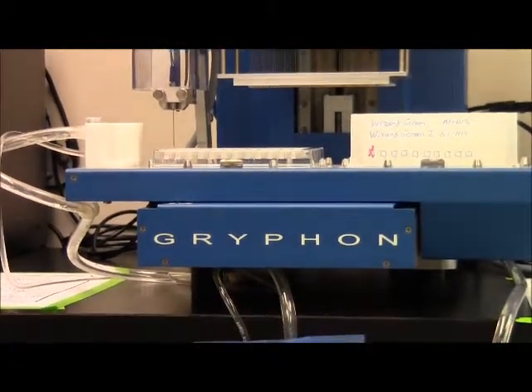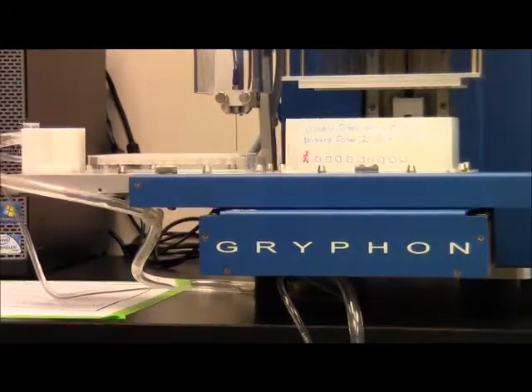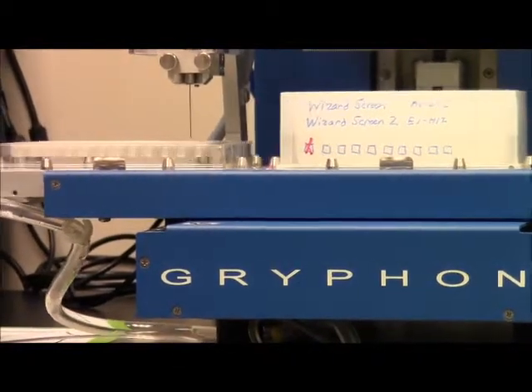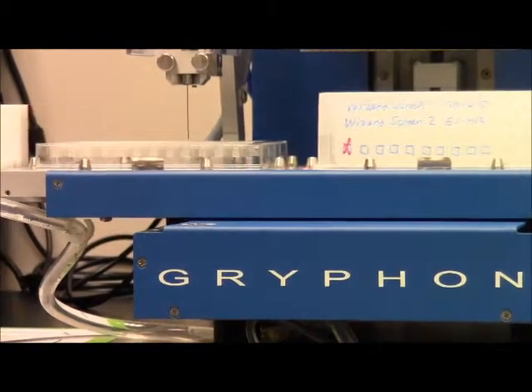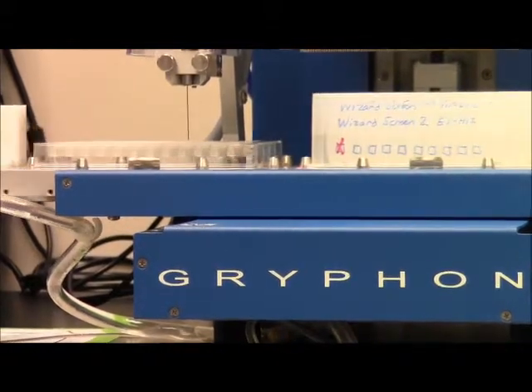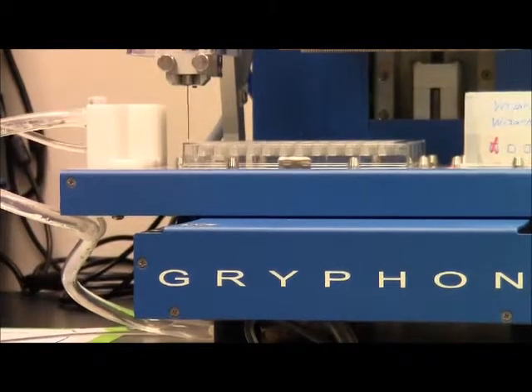Well number 1, 3-well: 1st row, 2nd row, 3rd row, 4th row, 5th row, 6th row, 7th row, 8th row — got crystals. Very good, 8th row.